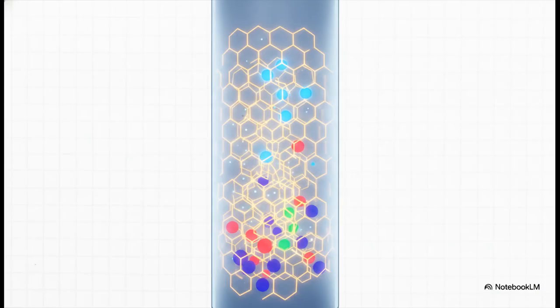I like to think of the IC system as a highly specific, microscopic obstacle course. When you inject your water sample, it gets pushed under pressure through an anion exchange column filled with a stationary phase. Now, different ions have different affinities for this stationary phase. They basically run the obstacle course at entirely different speeds. This brilliant separation effectively resolves our target chloride from any other interfering anions. So by the time the chloride finally reaches the conductivity detector at the finish line, it is completely isolated and perfectly ready to be quantified.